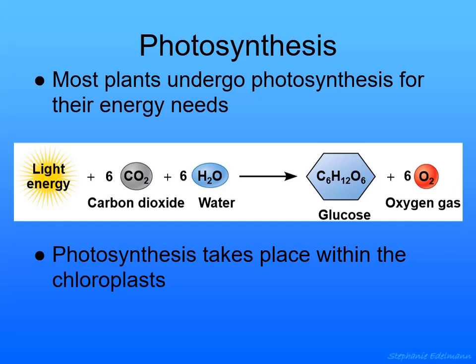What we're going to do, though, is we're going to go a slightly different route. We're going to measure the carbon dioxide. So carbon dioxide and water are substrates in this reaction. And so if you have this reaction going on, more and more carbon dioxide will be turned into glucose. So this is how our experiment works, and that's what makes it a little complicated. So we're going to have to think through that, but I'll try to keep you on track as we're going through this.